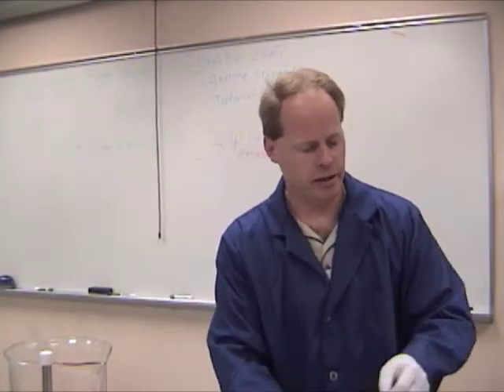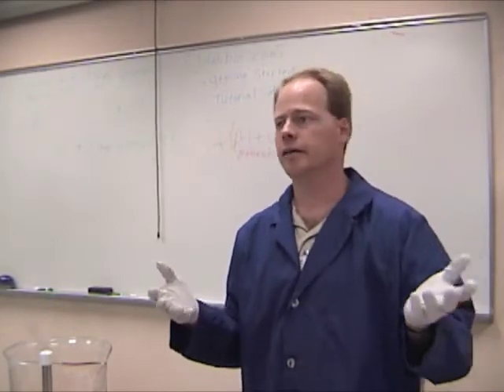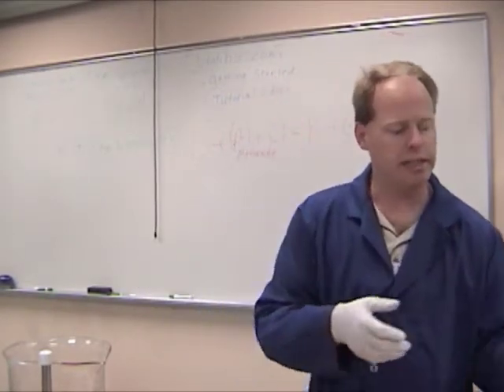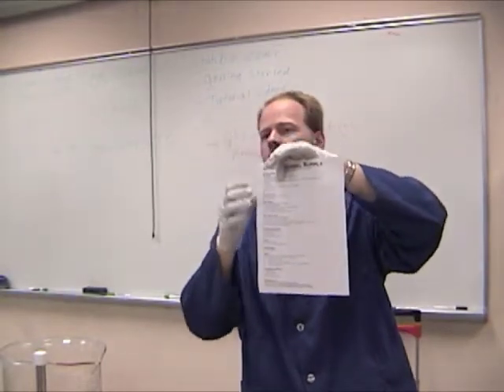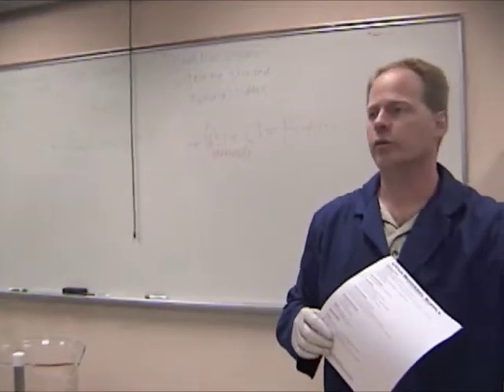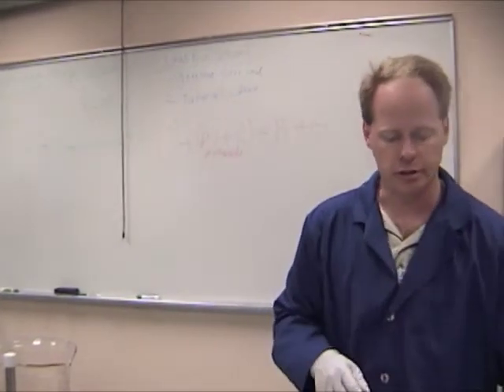So I'm going to make 1 liter of water. By the way, if you get a titration kit, it should have a lot of this stuff in it. Basically, this is your list of stuff you'd like to get if you get a titration kit. If you'd like to get one pre-measured or pre-done, we carry them. We've got some outside afterwards you can purchase from us as well.